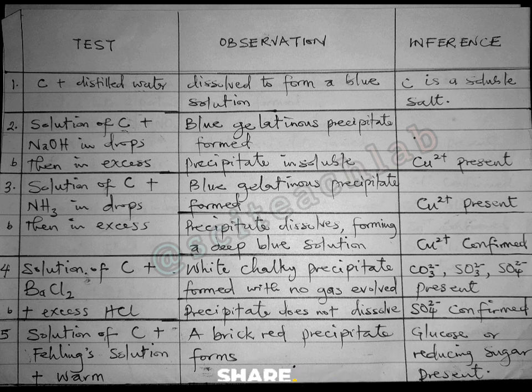So hydrochloric acid is not even enough to dissolve it. That is now how sulfate ions would behave. Sulfite and carbonate ions wouldn't behave that way. So that's when you've confirmed that it's actually SO4 2- ions that are present in that solution of C also.